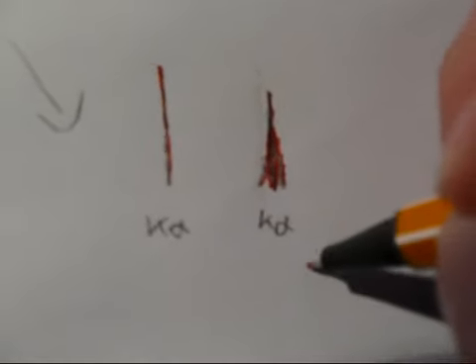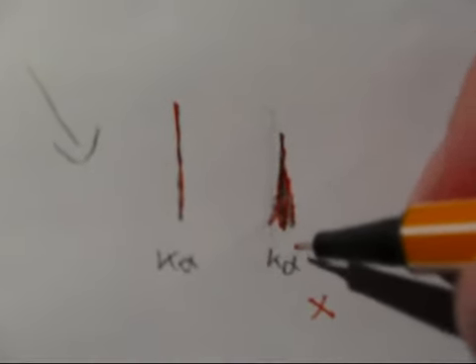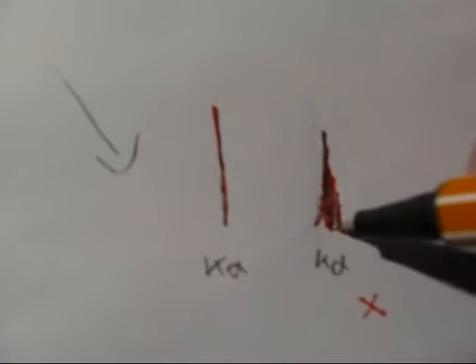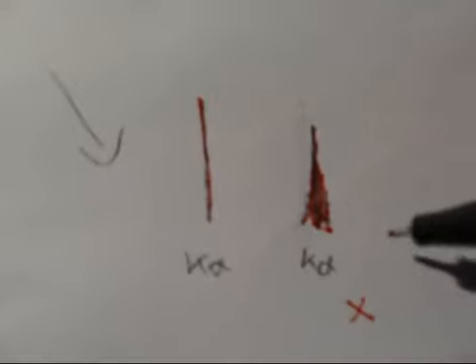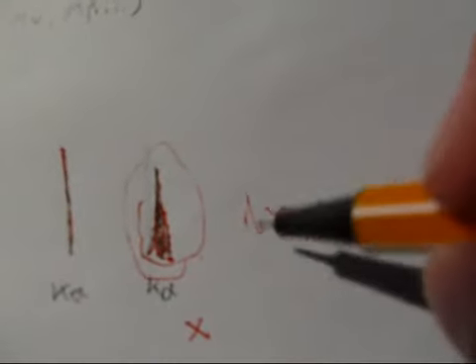This will tell you that it's likely that it is element X. But the thing is that you actually have to compare all the peaks, K alpha, K beta, L alpha, L beta and so on, because say the K alpha peak of one element may be equal to the L beta peak of another element. So it's very important that you look at all the peaks you get in sample analysis, which may look like this.